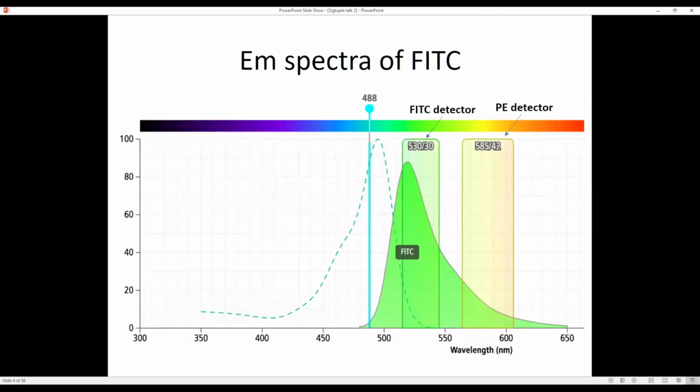Now take the most common fluorochrome, what we talk of is FITC. I suppose those who are working with flow or know something about flow should know about this fluorochrome, fluorescein isothiocyanate, which is FITC. Now, this is the laser line, okay? This is the blue laser, which emits a monochromatic light of 488 nanometer. So at this particular wavelength, the FITC gets excited, okay, and it emits light of a different wavelength, right?